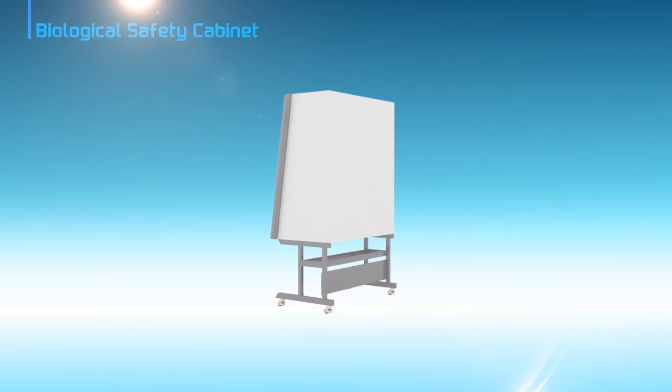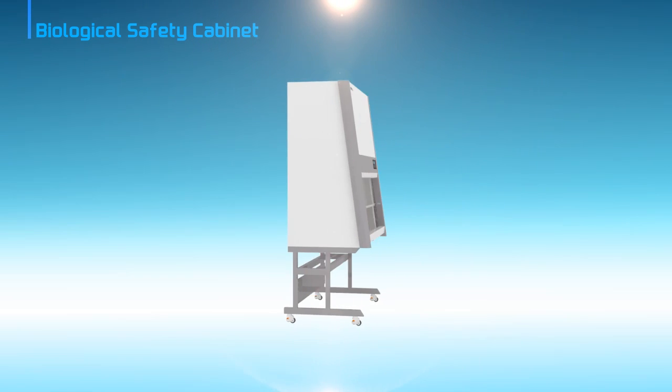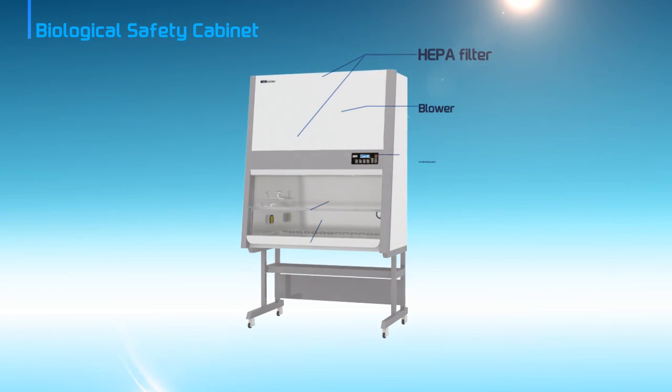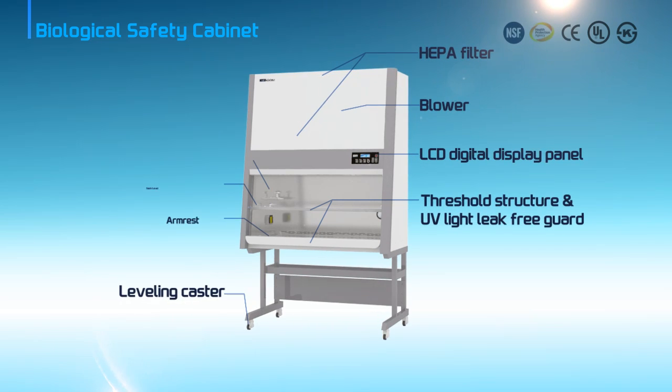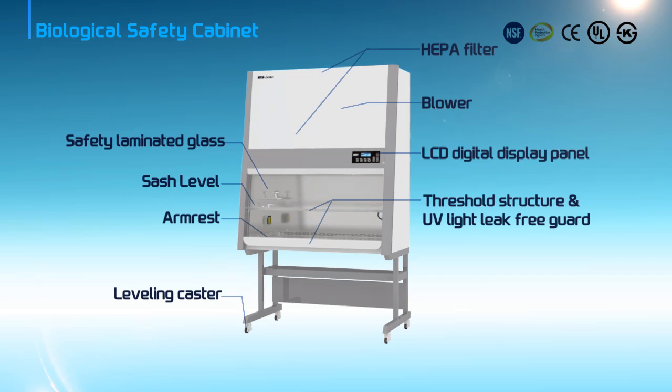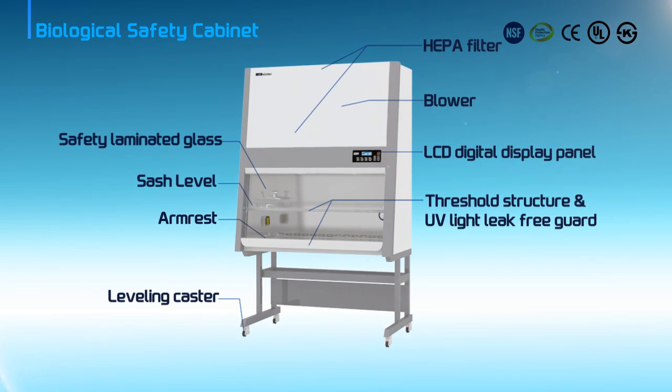CHC Lab Biological Safety Cabinet is an essential equipment for bio experiments. The Biological Safety Cabinet mainly protects the researcher from contaminated air and must be designed to supply clean air constantly to inside of work surface through HEPA filters and prevent contaminated air from coming out of inside chamber.